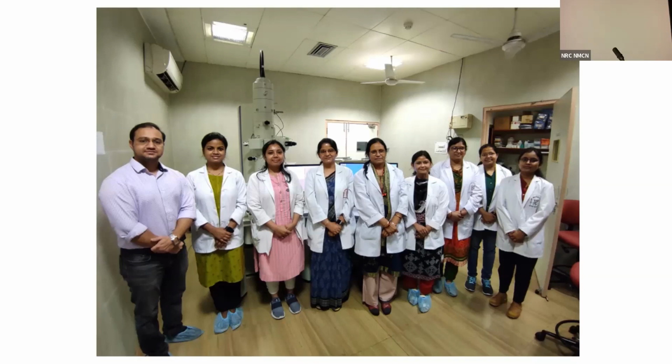And you have to realize that the amount of tissue that you are looking at in an electron microscope is very small. Not so small as it appears, at one time you may even see 3-4-5 long lines in the same section, but otherwise it is small relatively. So if you see a small area and say these are just sparse granules, these are just dense granules, that will not be right.